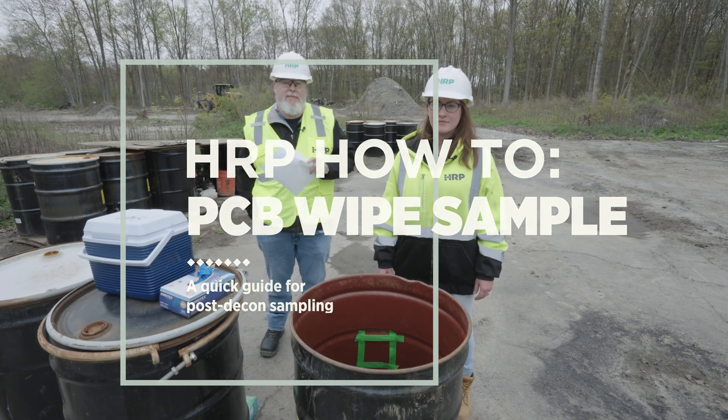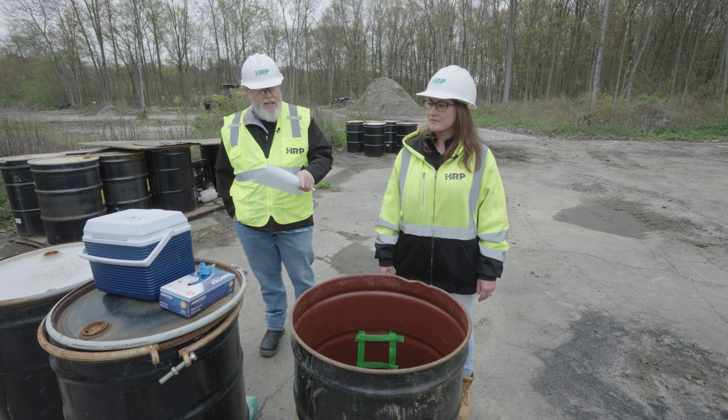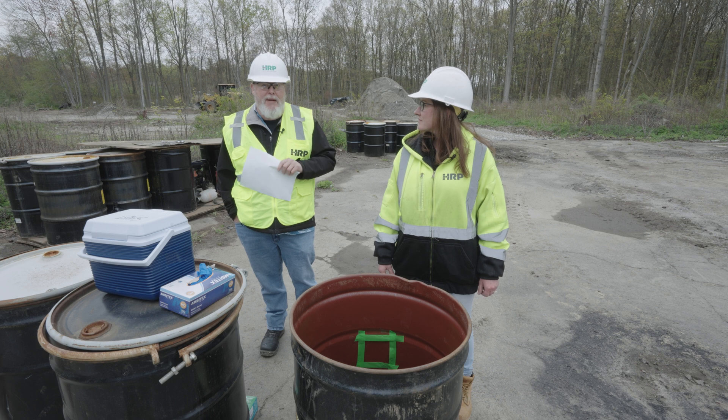Hey everybody, I'm Bubba. And I'm Lauren. And we're here on site today to take a post-decontamination PCB wipe sample.